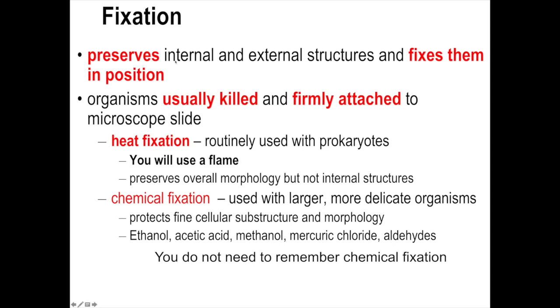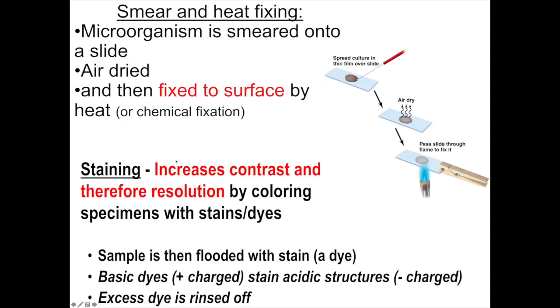Now, fixing a sample essentially kills the sample. And when I say sample, I mean some type of microbial sample, either bacteria or fungi typically. The fixation actually fixes them in position and preserves structures. So in lab, you carry out heat fixation, right? And don't worry about chemical fixation for the purpose of this class.